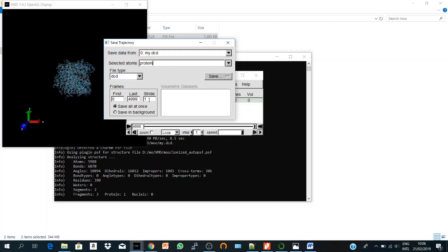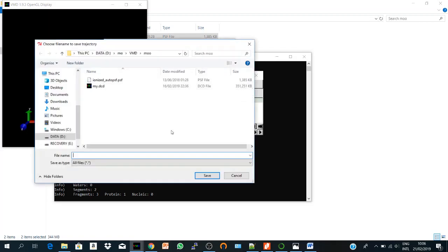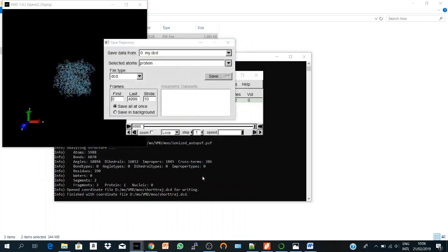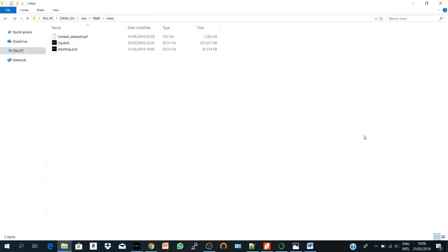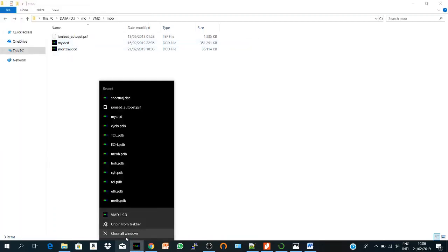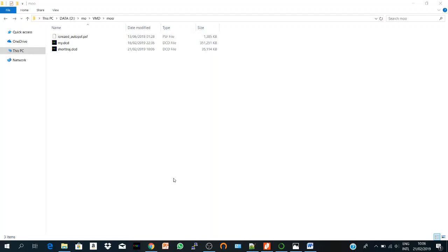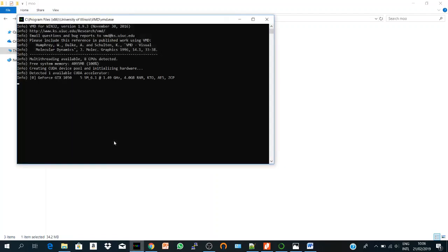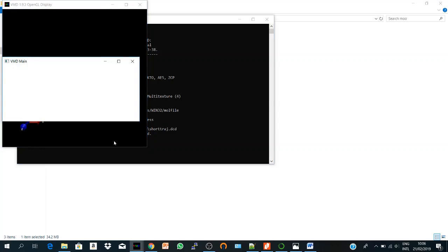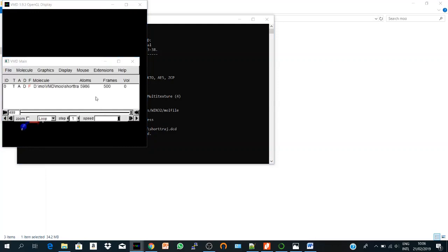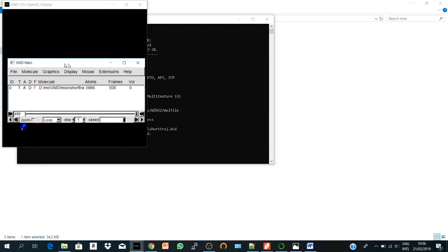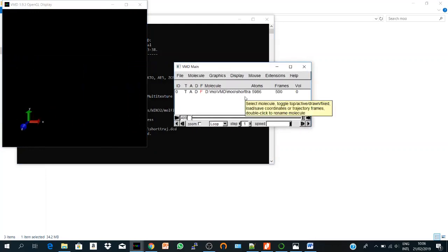But if I said save every 10th frame and I say Save, and I say short trajectory.dcd and I hit save. So here I got the short trajectory and let's check it. Yes, directly, so I have only 500 frames, so it's very short and very easy to handle.